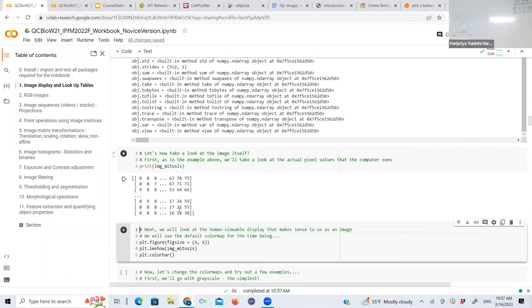Sometimes 8-bit images are stored as integers from 0 to 255. But you can also convert images to a scale of 0 to 1, where you divide by 255 and everything goes from 0 to 1. Sometimes that is really important for processing your images, and it's called converting the images to float.